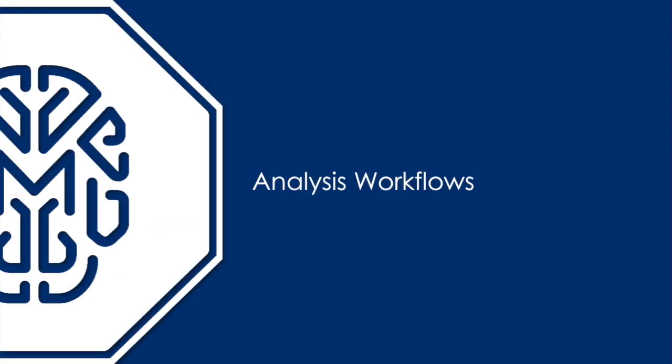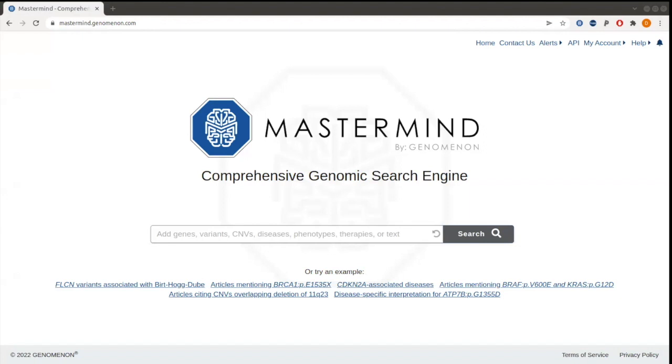Now that Diane has gone over the foundational aspects of Mastermind and how the data is presented and organized, we'll go over some introductory analysis workflows recommended to help get you started. Keep in mind that these workflows are shaped by what we just talked about in the general concepts. All right, thanks very much, Brittany.